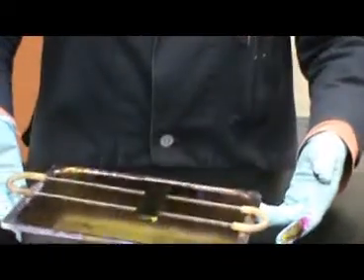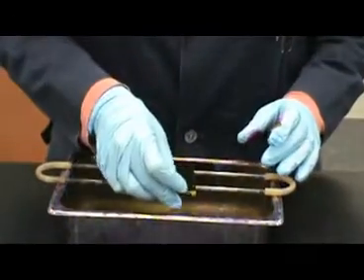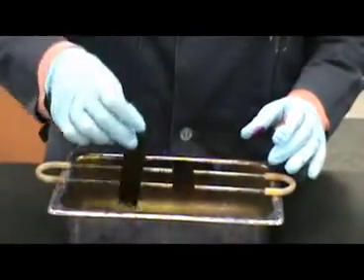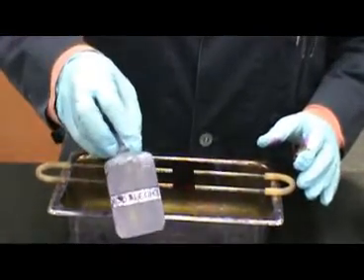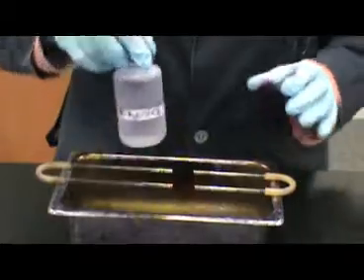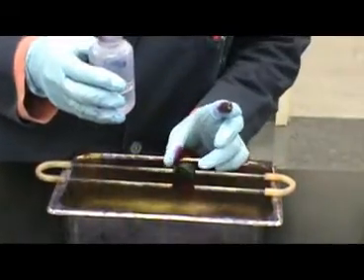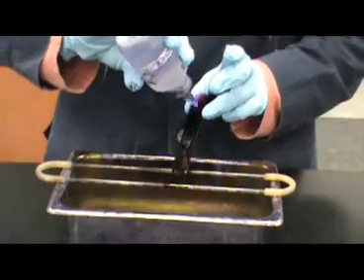At this time, after allowing the slide to cool for 1 minute, remove the piece of paper towel. After removing the piece of paper towel, place it into the staining tray, and you are now ready for decolorization. The decolorization step in acid-fast staining uses acid alcohol. The acid alcohol is gently run down the slide. It is helpful to rinse both the front and the back of the slide. When you rinse the back of the slide, your labels will be rinsed off.